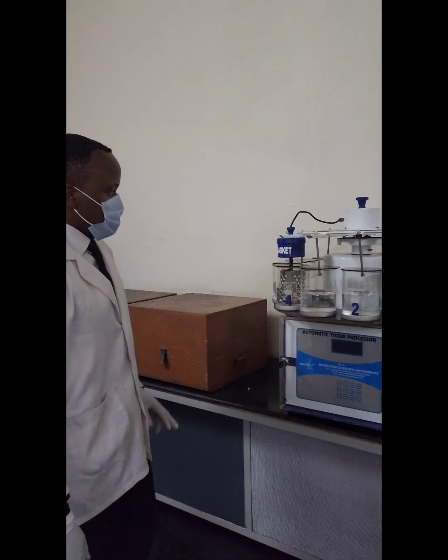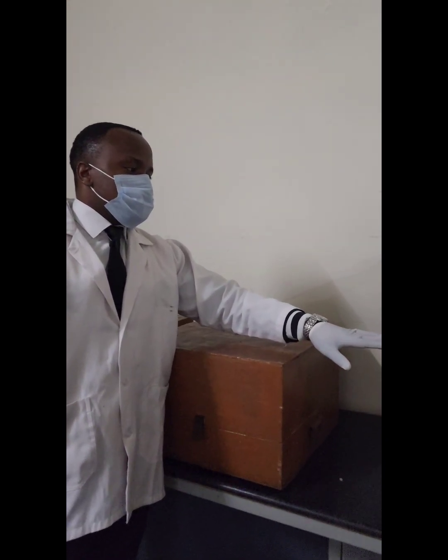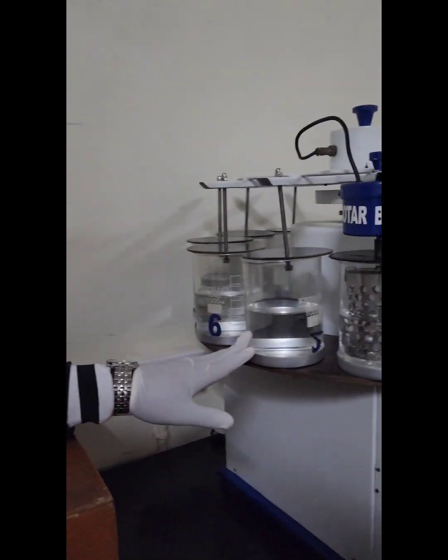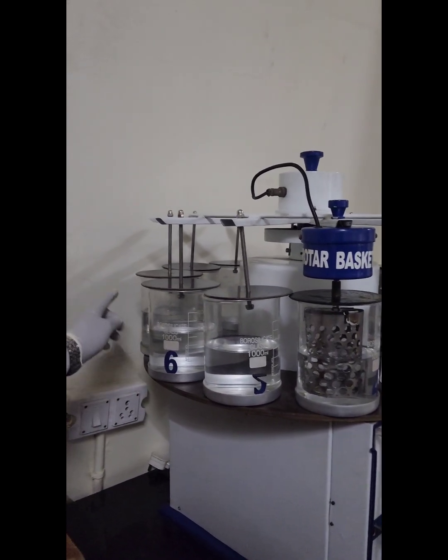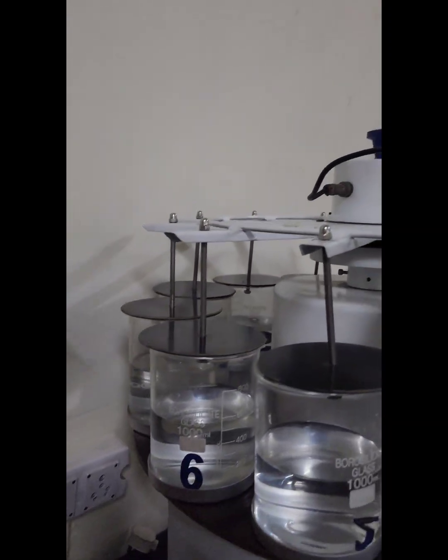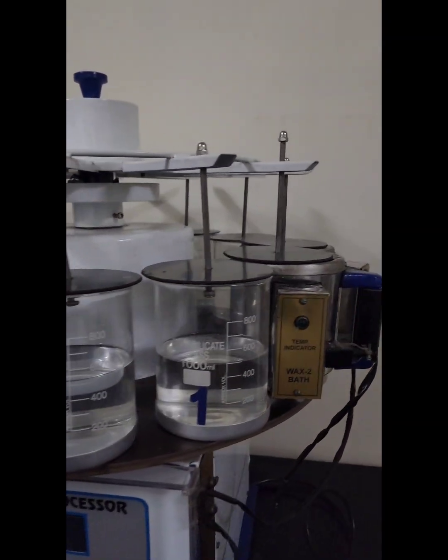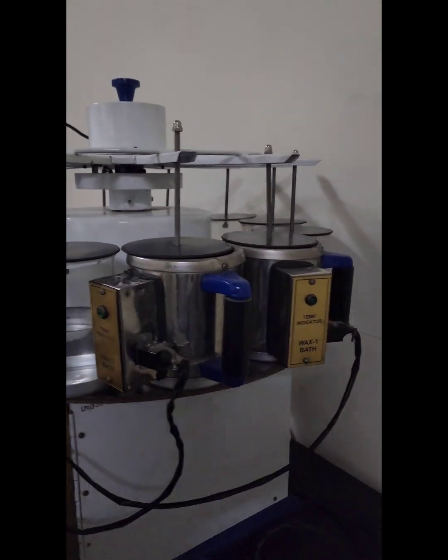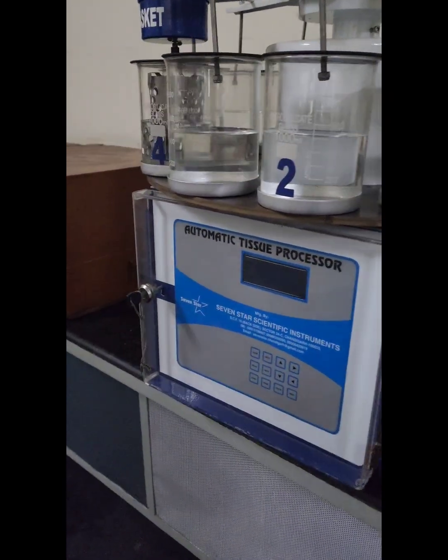Down there you can see where we can enter our instructions and our timers. On top we have the jars and the basket that is inside. In the basket we can place the tissue specimens already in cassettes, which will be transferred from one jar to the other until the whole process is complete. Use of an automated tissue processor helps us to cut time.